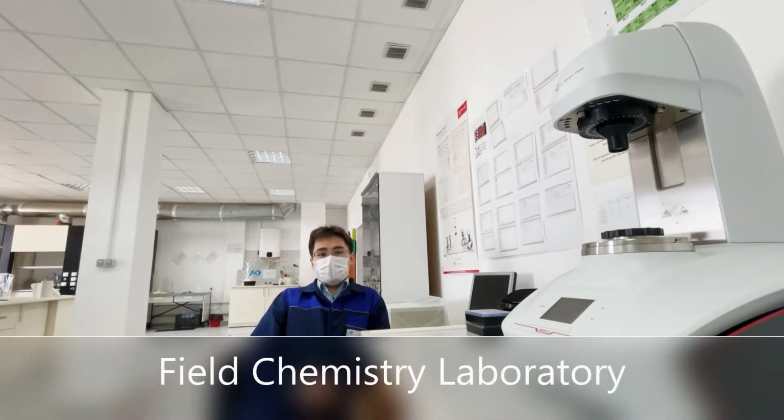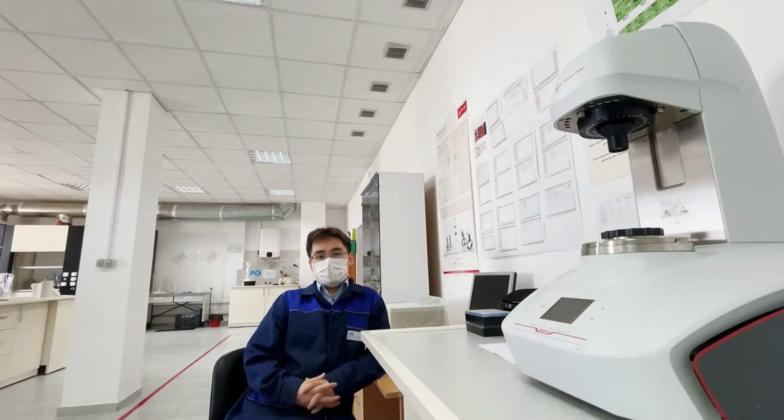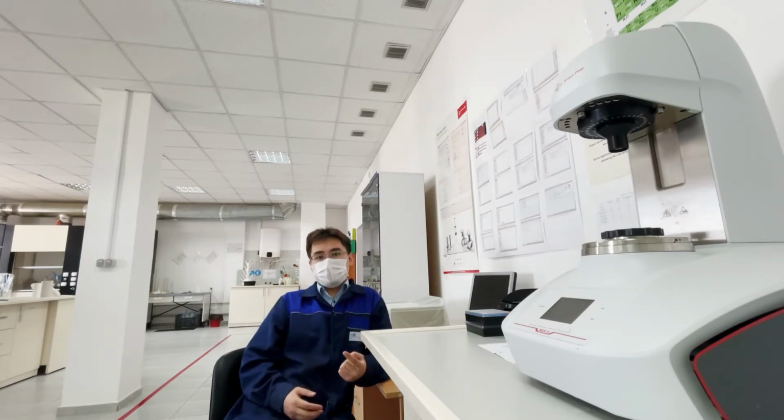Now to the field chemistry laboratory, and here we perform the services to ensure incoming control of chemical reagents, laboratory research in the selection and the pilot production of new types of chemical reagents for the collection, treatment and the transportation of oil, gas and water. Also the selection of surfactants, flow diverting technologies, etc. and incoming inspection of polyacrylamide at the customers' fields.